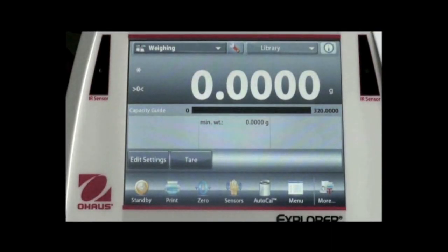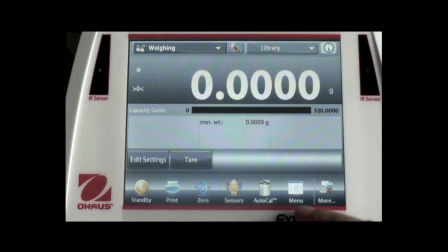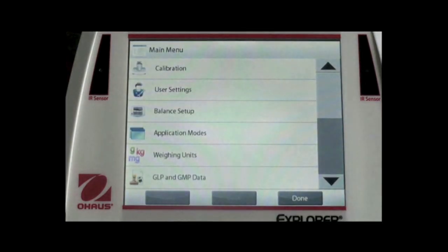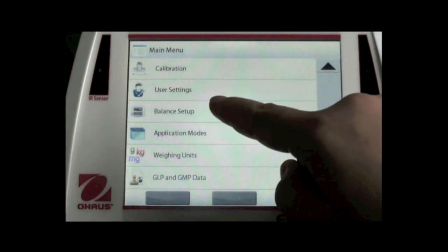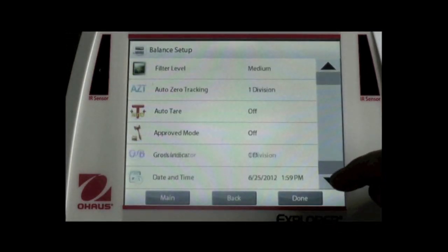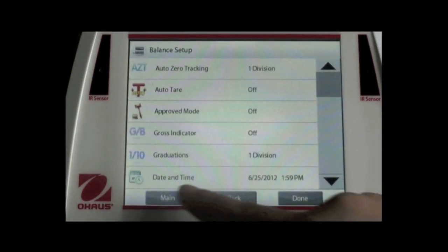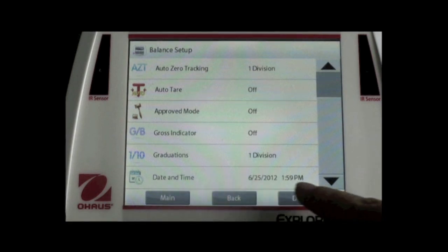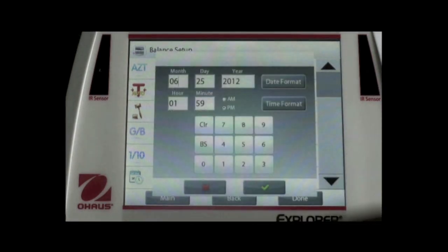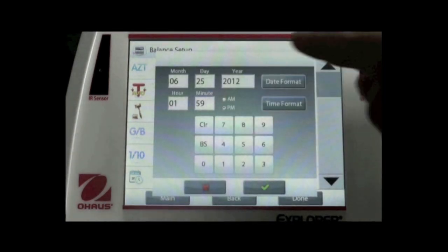Setting up date and time only requires you to press four buttons. First, press the menu button, find balance setup, press the button, scroll down — there is a date and time button. Press the button and it shows the date and time setup screen.